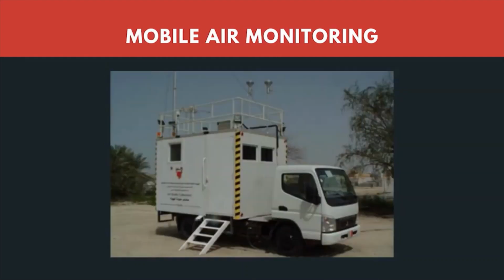While effluent testing is happening for the liquid effluent, ambient air is also continuously monitored, and it is all done with the help of a mobile air monitoring unit. Generally, the quality control department takes care of the mobile air monitoring unit, and continuously reports the constituents of the ambient air, whether it has pollutants like sulfur dioxide, carbon dioxide, carbon monoxide, and the nitrogen oxides. All this data will be shared with the statutory authorities.